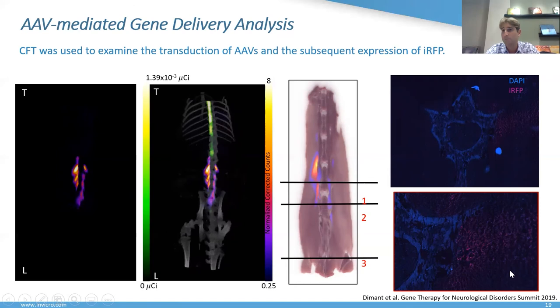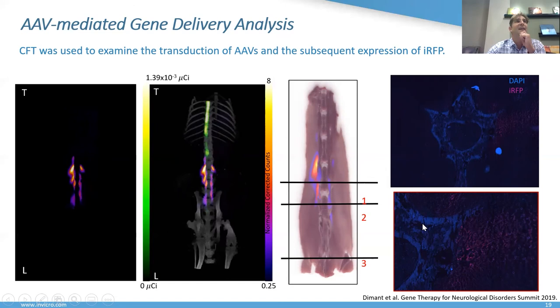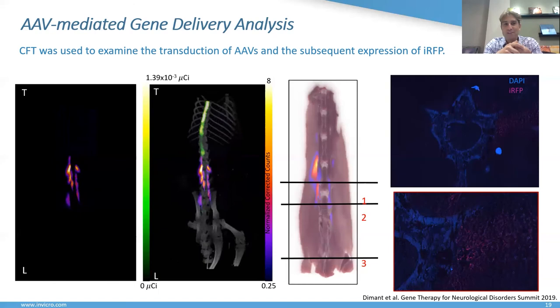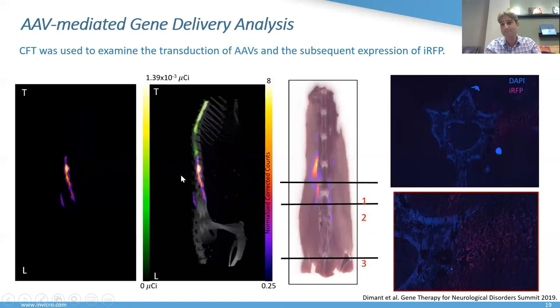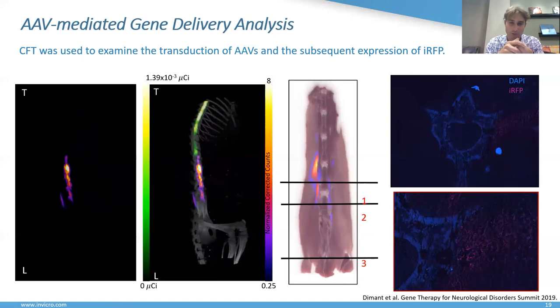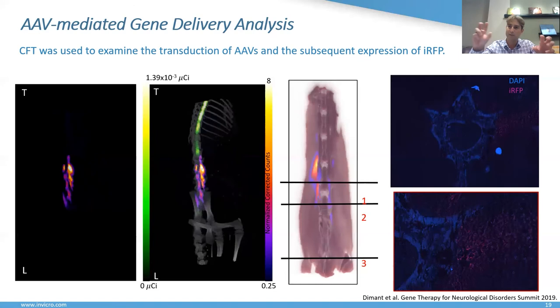There was a clear difference between AAV distribution and the subsequent IRFP expression. We confirmed the IRFP expression was completely outside the vertebra. Although the intrathecal administration was successful — we saw distribution all the way to the head — the expression was outside the vertebrae, which we confirmed by collecting sections from the same sample for microscopy. The likely reason was that the catheter remained in place for four weeks, creating a wound in the lumbar region that caused some AAVs to leak out and express in surrounding tissue.